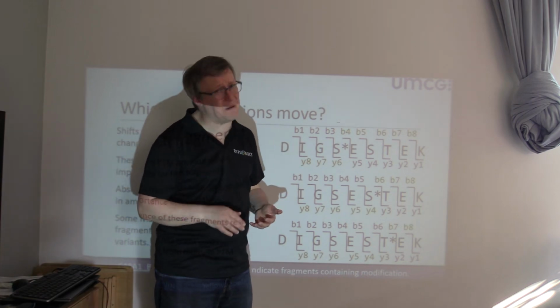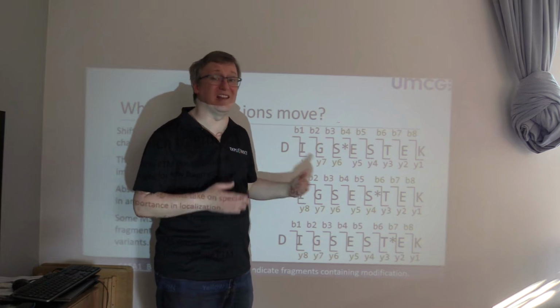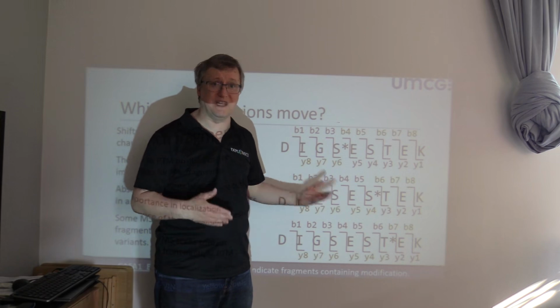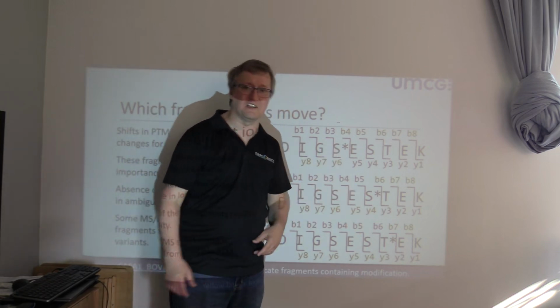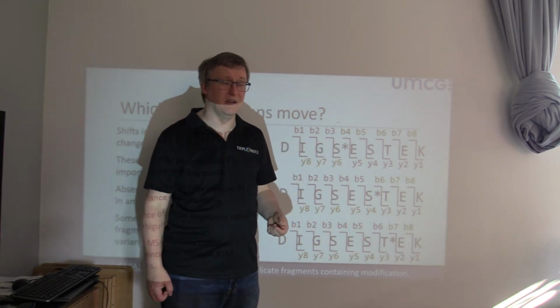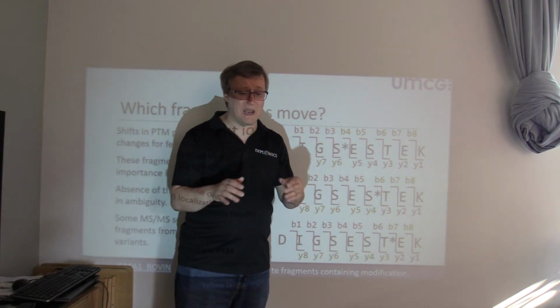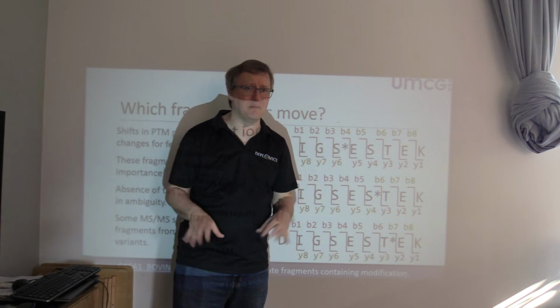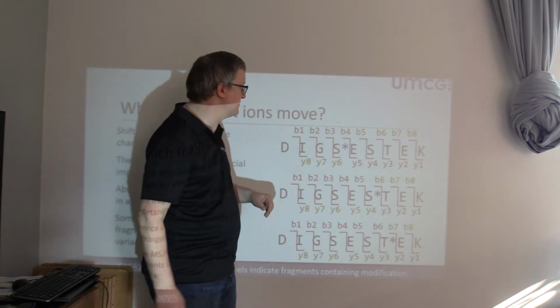The answer is probably not. Are there some slight differences that might creep into their retention times because of the presence of the PTM at different sites? Maybe. But we would certainly not expect that C18 material will neatly resolve these into separate bumps in separate chromatograms.